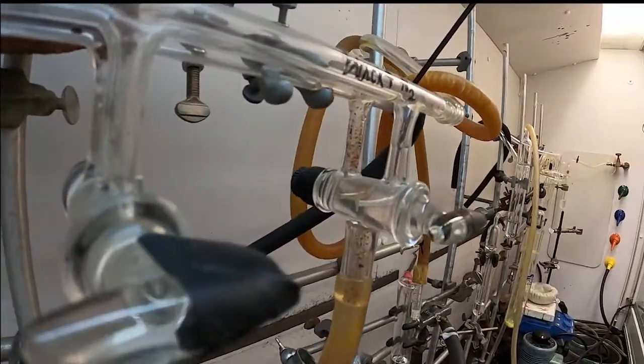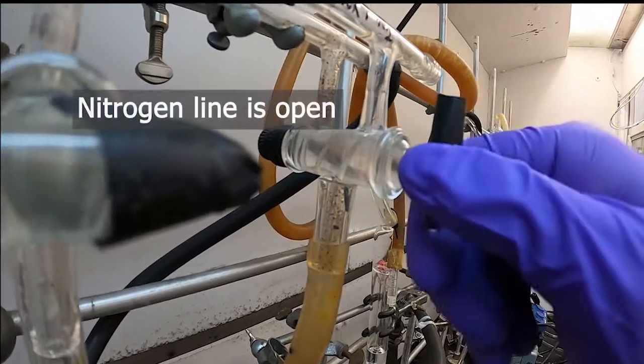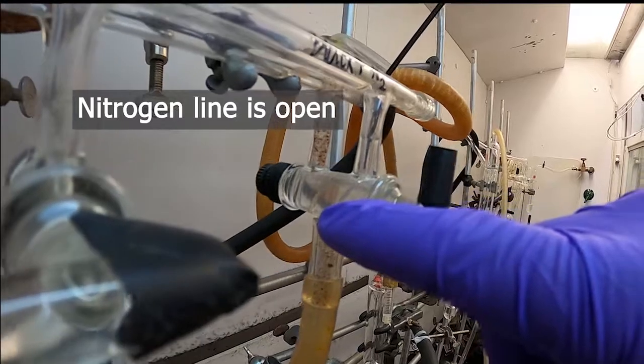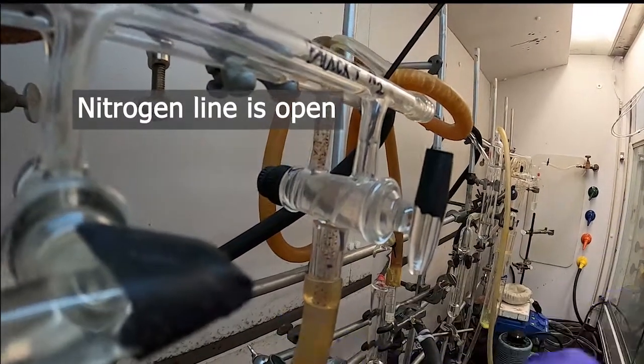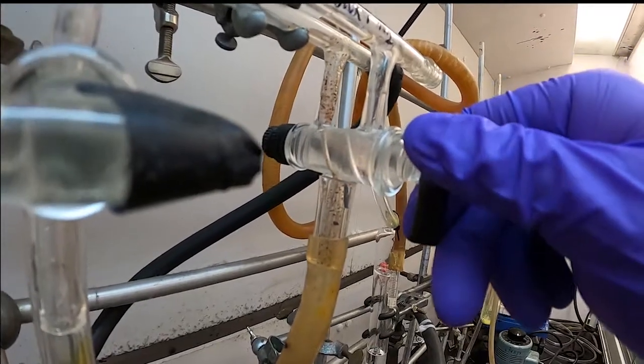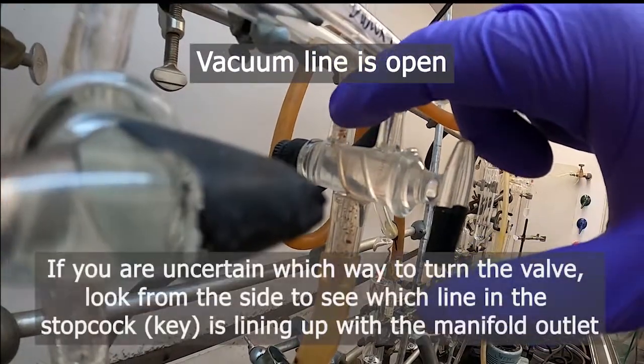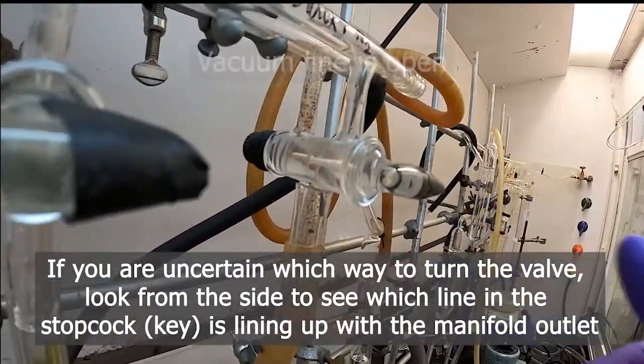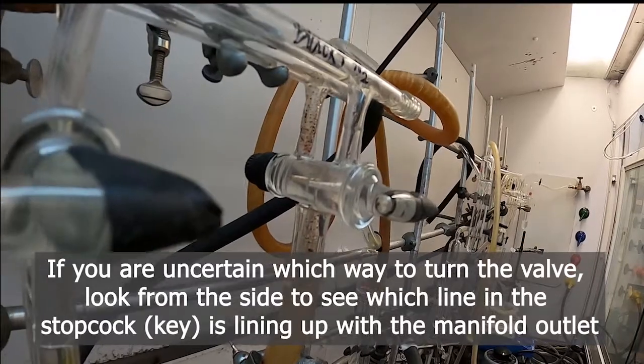These stoppers work differently. So in this case, up connects the nitrogen line through the diagonal portion of the stopcock and then to the tube. And then if you turn the opposite direction, the rear portion, so the vacuum line is then connected to the tube. And then horizontal is off position for both.